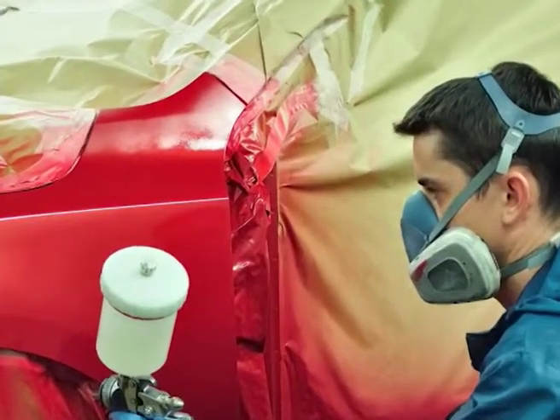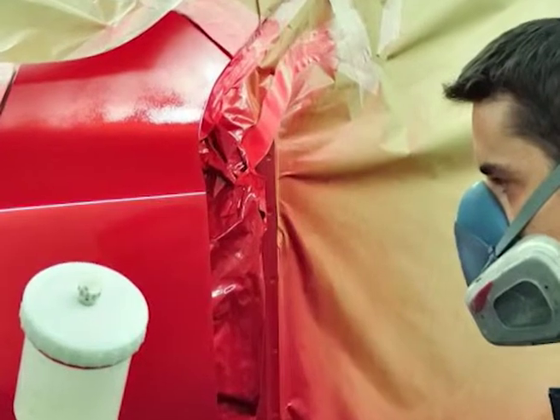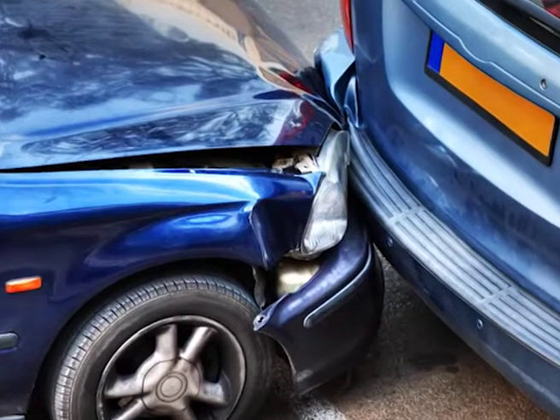Once the evidence is recognized, try to remove it manually before using tape lifts to collect evidence. It is collected with tape lifts very carefully, being aware of the difficulty encountered while manipulating the paint samples bearing adhesive residues. If the contact between any two coated surfaces is indicated, then there is a possibility of cross transfers. As a result, it is made sure that the samples from both the surfaces need to be collected.